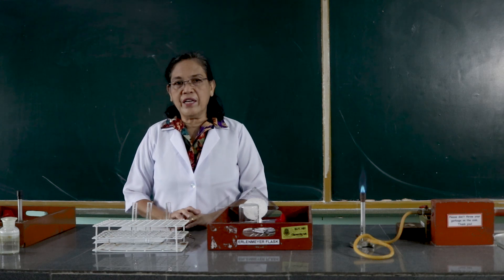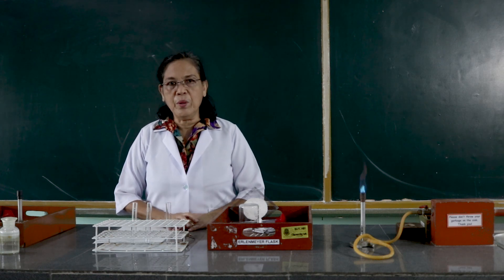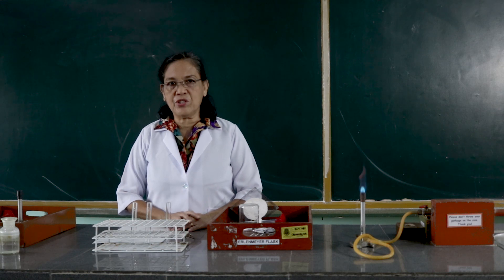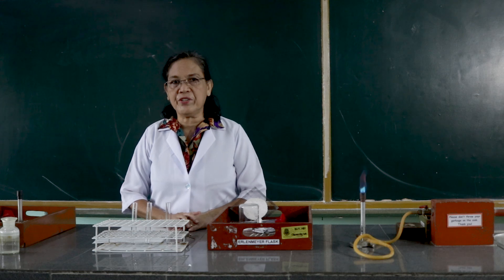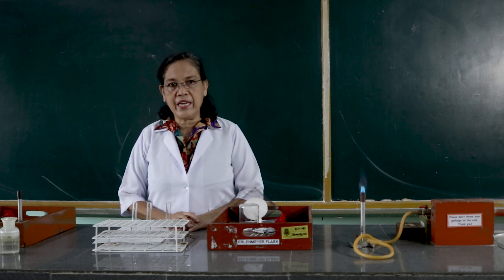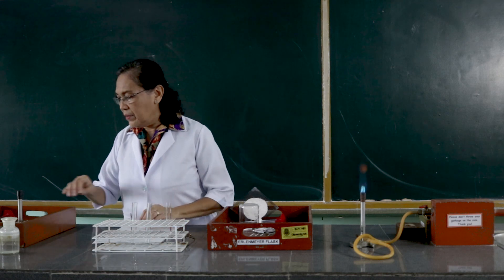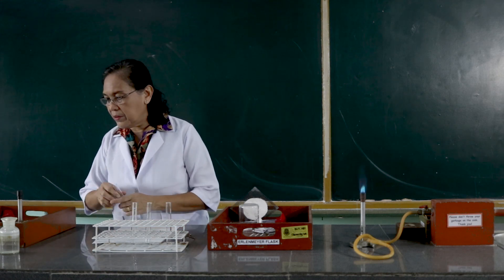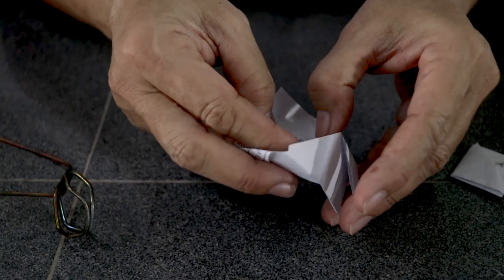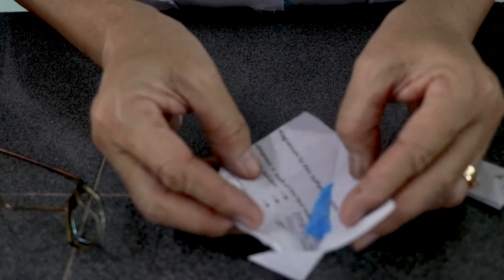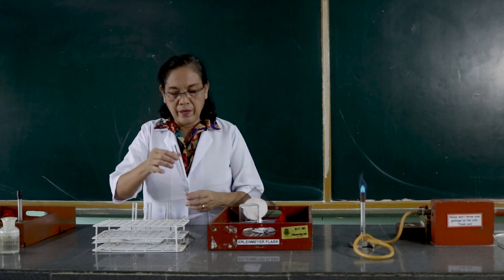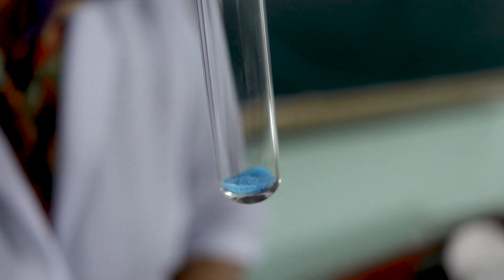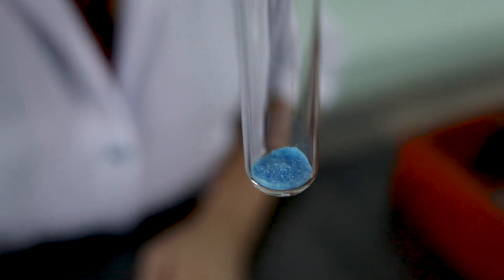In this experiment, we are asked to heat a blue vitriol in a test tube. I would like you to observe what will happen to the blue vitriol after it is being heated. This is the blue vitriol, chemically known as copper sulfate pentahydrate.